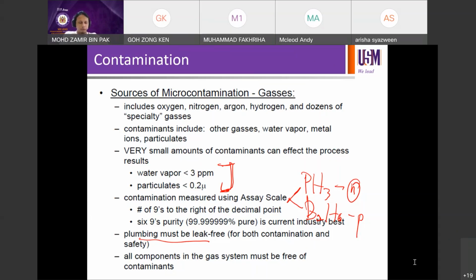Okay, kalau ada, you don't know, someone mungkin suffocated ke dengan gas, tak sempat lari ataupun tak perasan tengah buat maintenance in the equipment, but tak dengar ke, I don't know, for some reason. Right, it happens. Tapi most of the time we are clear lah. So just in case, get the numbers right first and see your buddy, see your colleagues, whether they are around. You'll be categorized as in your department.